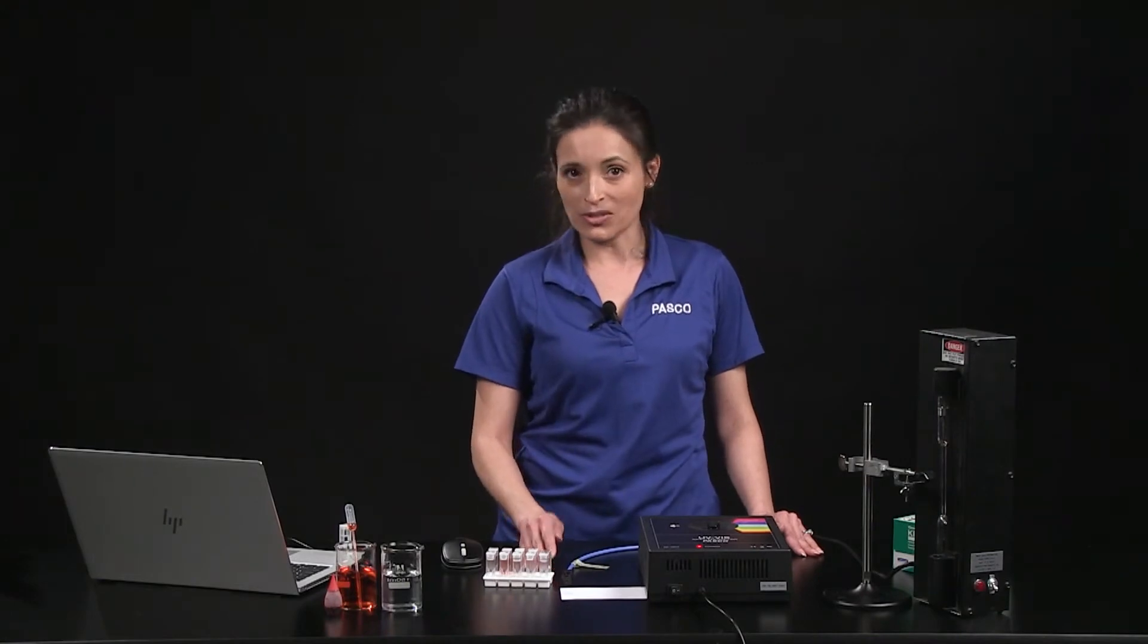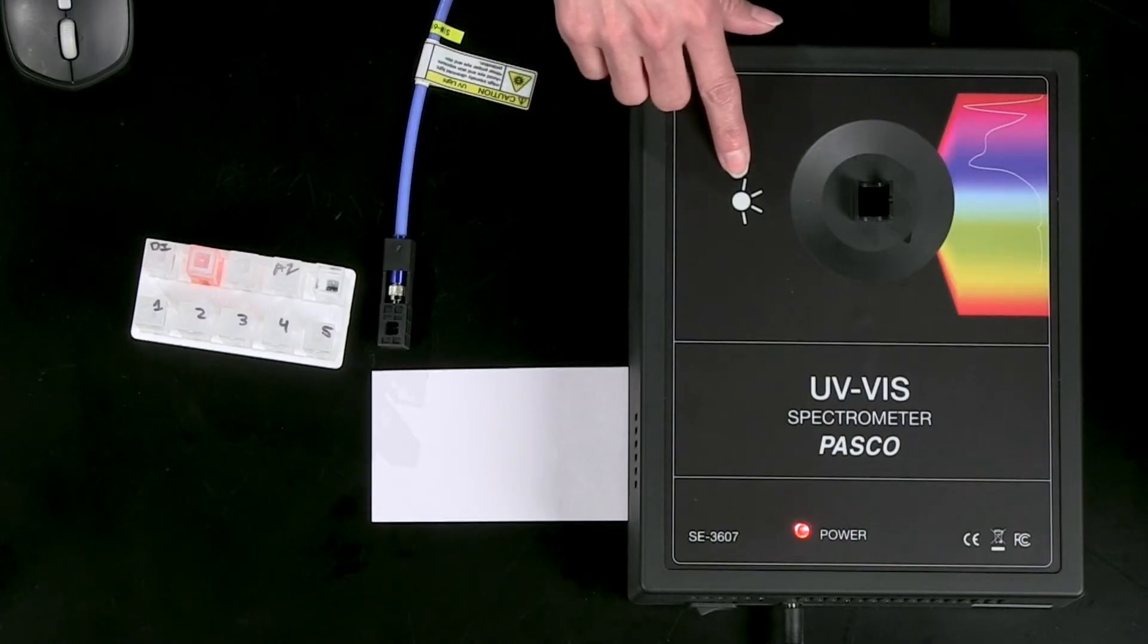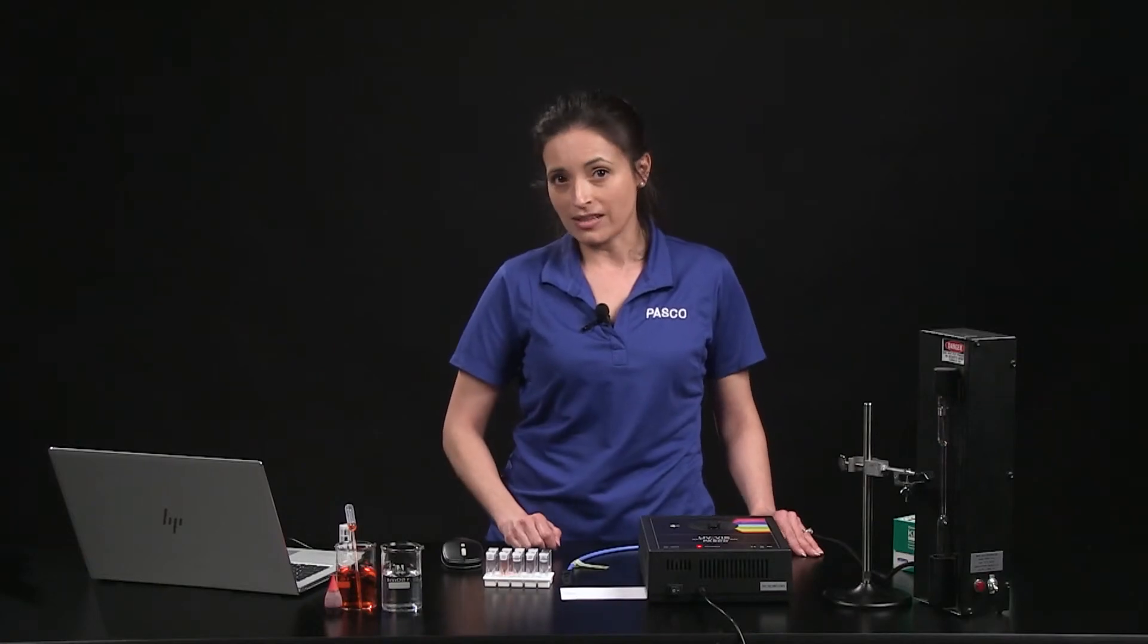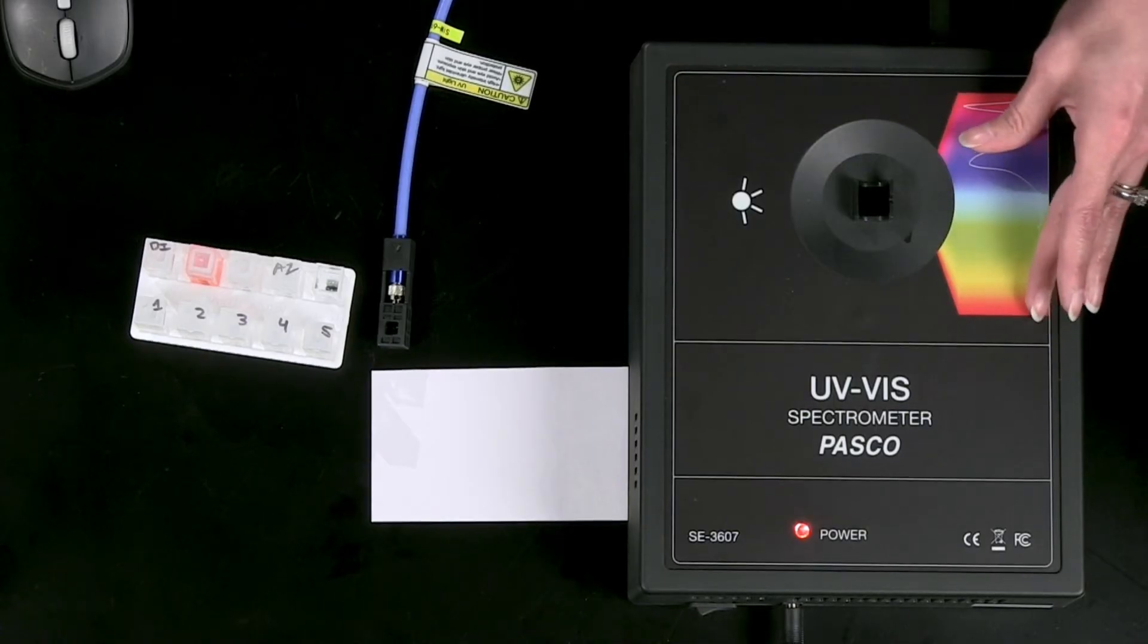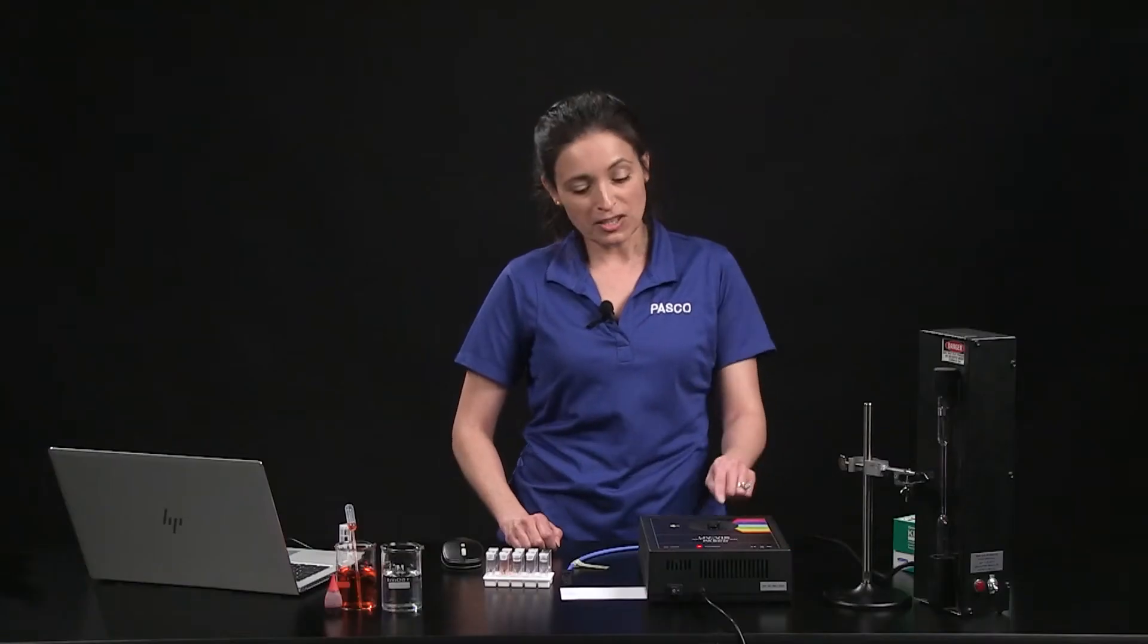The spectrometer's light source is located here, below the white light graphic, and the light detector is located on the side with the colorful visible light graphic. The cuvettes are placed here.